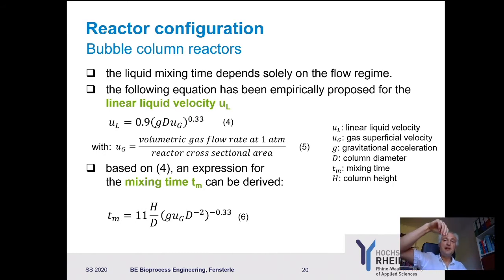So I pump in my base. Again, I want to come from pH 6 to pH 7. Now, of course, if I have a stirred tank reactor or whatsoever, I come with a high concentration there after bringing it in to the sensor. And this high concentration at the beginning is just because the stirrer just brought it there, or because my bubble column reactor pushed this high concentration to the sensor. It will drop down immediately.